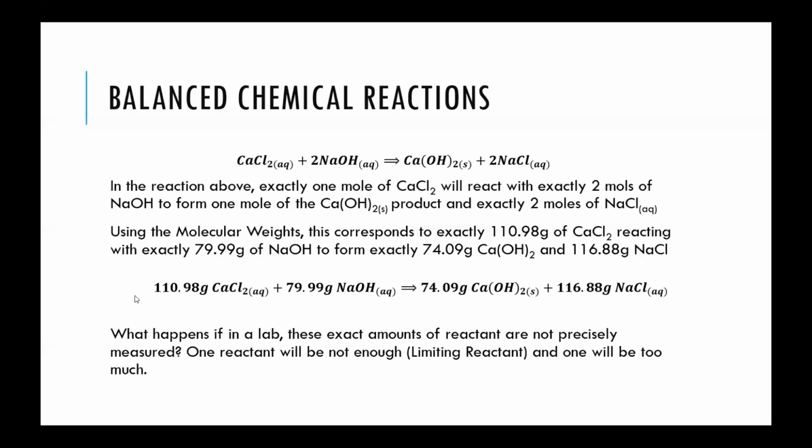But weighing out these exact masses can be tricky because there can be variability. These are also based on truncated atomic weights. So the actual down to the molecule would be farther out and have a greater level of significance.